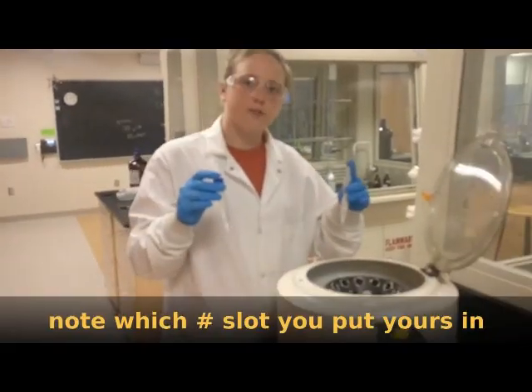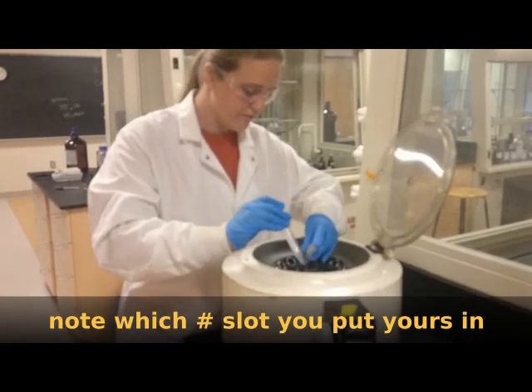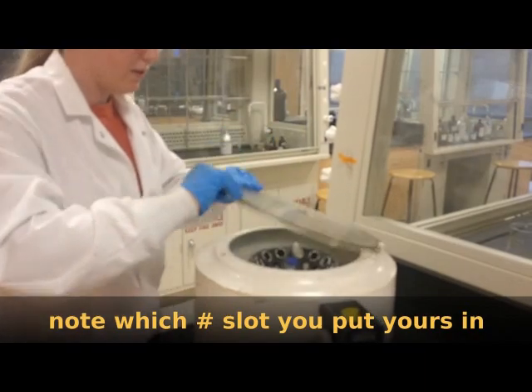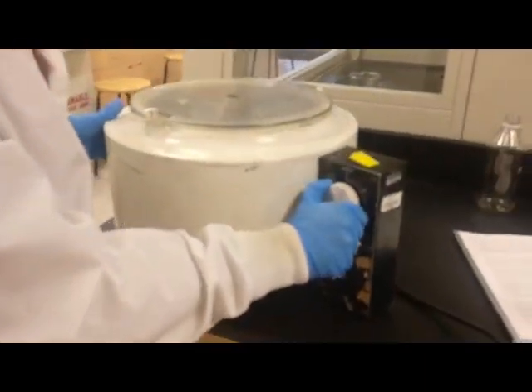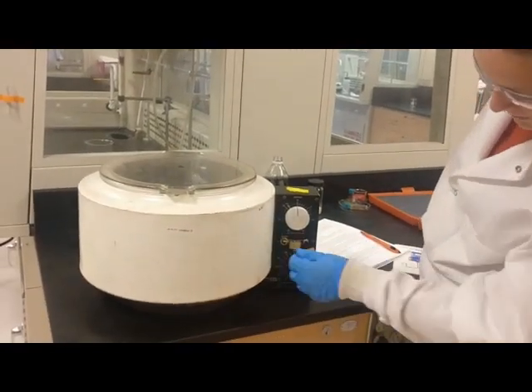You put this in the centrifuge. You want to make sure your balanced tubes are opposite sides of each other. Close the lid. We're going to set our timer. To stop the centrifuge, you hit this break button.